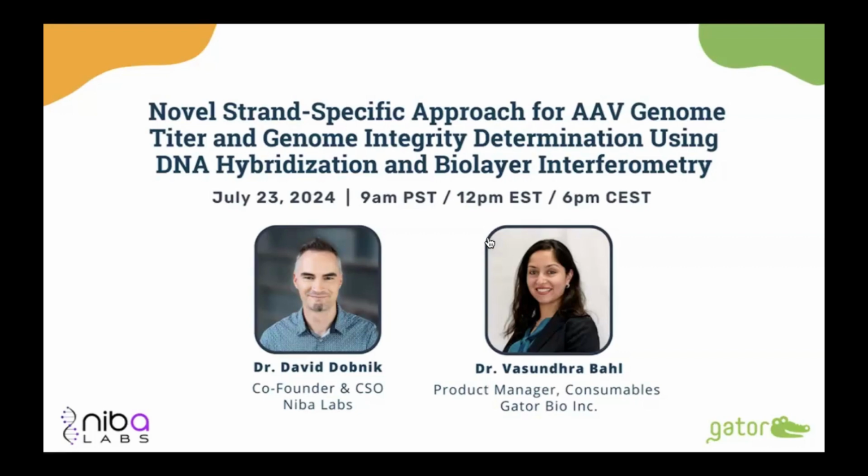Okay, so the first question is, does the standard curve need to be plasmid DNA, or can AAV gDNA be used? Yes, I perhaps slightly answered this question after it was typed. But anyway, as mentioned, we've used only AAVs in our example as a standard, so it can be AAV DNA.